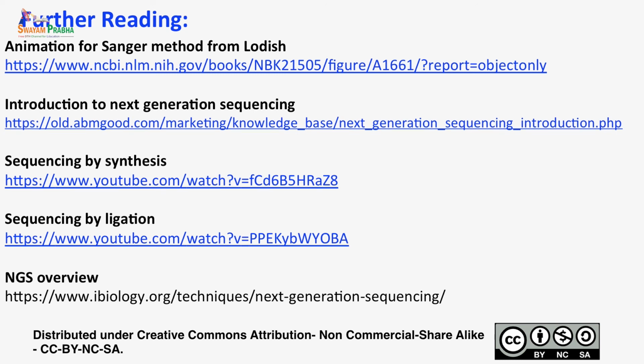At the foundation level, you already know about PCR, you already know about how polymerase works, how ligase works, and therefore those things are known, and the only thing that you need to understand is how the parallel sequencing is done, how the bridge method works, how the sequencing by ligation works. So to see that in an animation will help you further understand these topics.